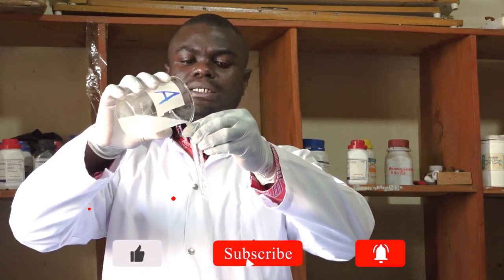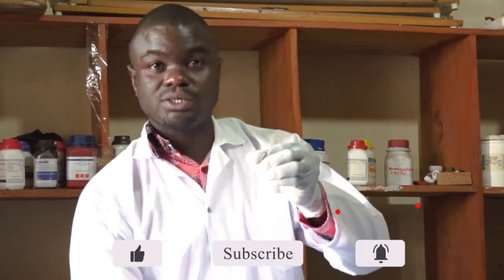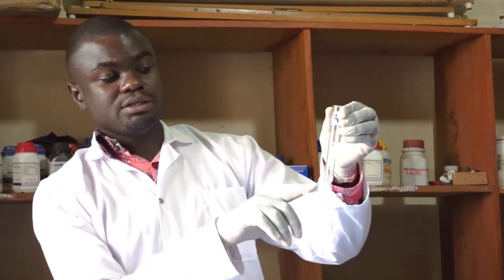Remember, the more little the quantity that you use, the more accurate you become. So remember again to take note of the color of the original solution A, and you can see it is a turbid solution. One can call it a white suspension.